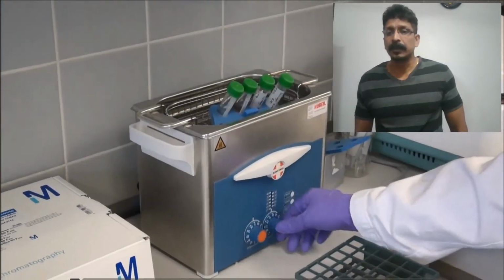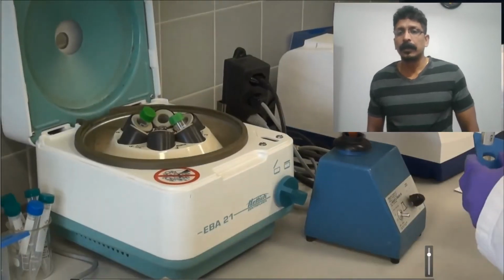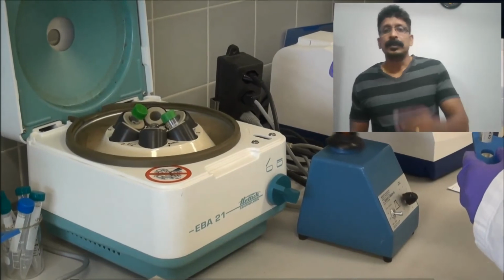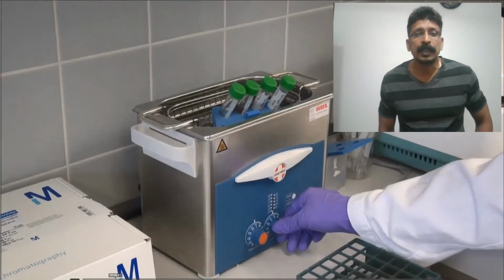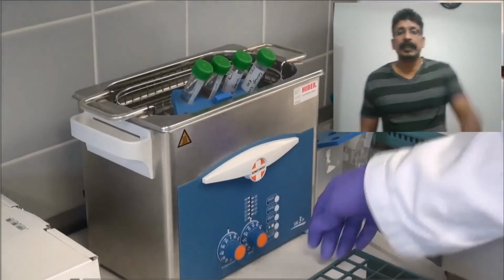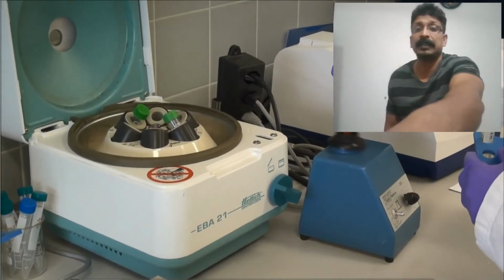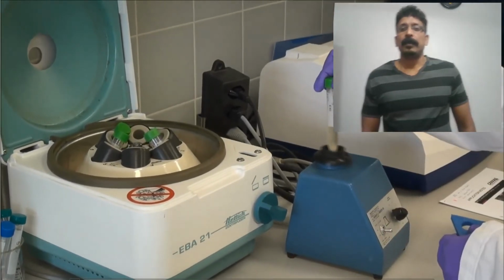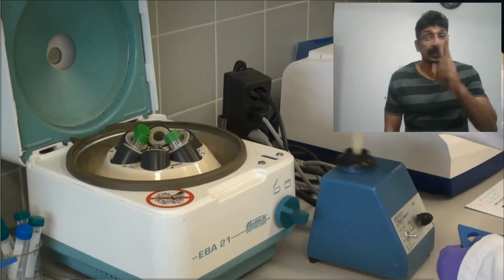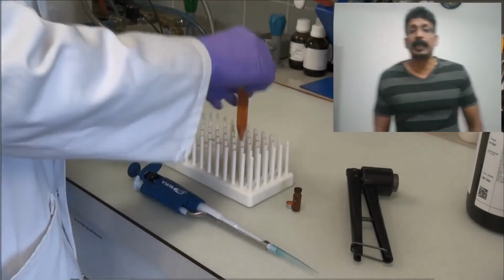You see now what she is doing. She came to centrifugation. Before centrifugation, you should know, this is ultrasonic. See there? Ultrasonic. After ultrasonic, she keeps it in the vibration. This is the vibration. After vibrating, she keeps it in the centrifugation machine. See that? That's three steps, and centrifugation. In centrifugation, she kept it at 5,000 RPM. Then she brings that supernatant liquid.